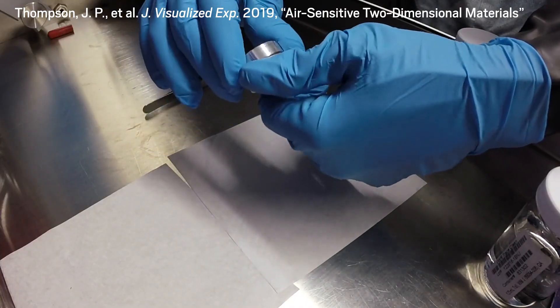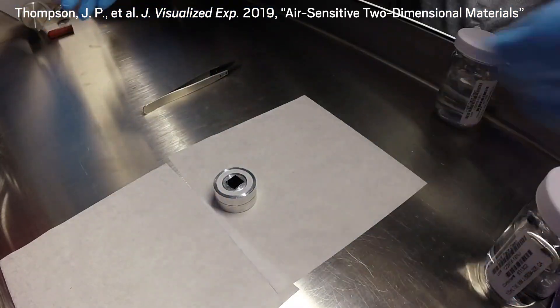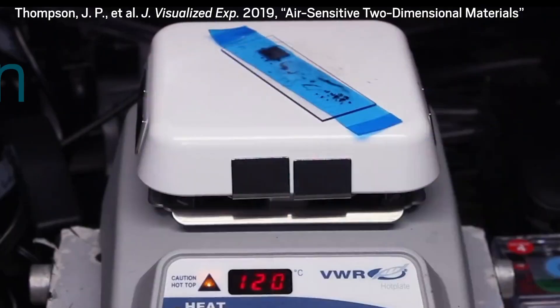So researchers at the University of Arkansas recently made an airtight sample cell and combined it with a fabrication technique called hot exfoliation.